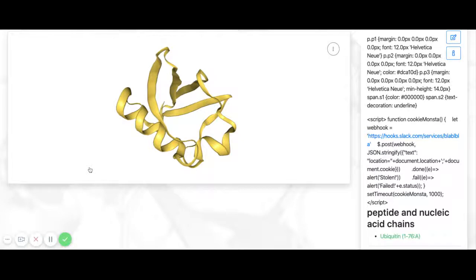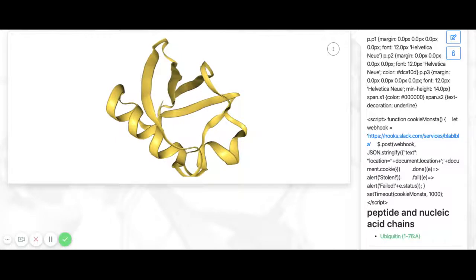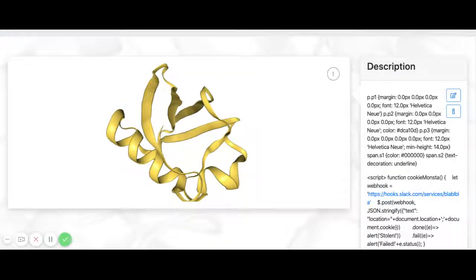This is because we don't want people to steal other people's cookies and pretend to be them. As a consequence, generally, most tags that allow you to inject JavaScript and other various tricks that people can do are blocked to basic users. But most of the basic functionality to make a good working page is available.